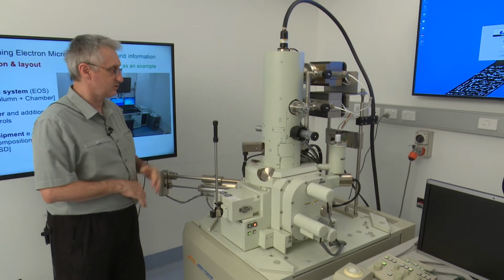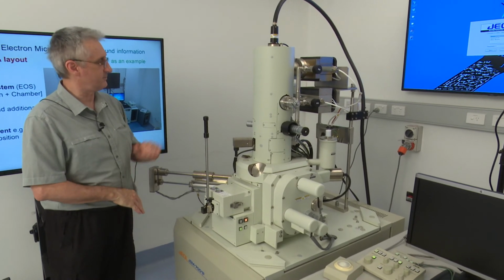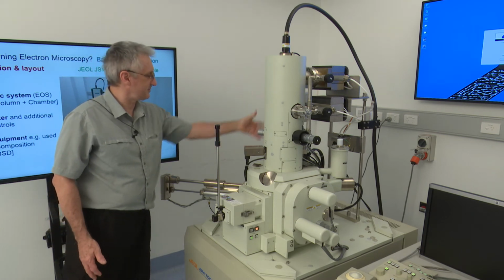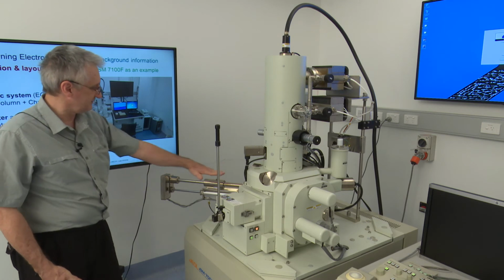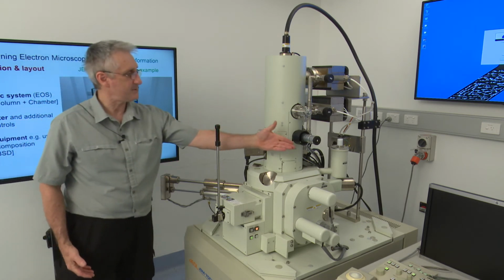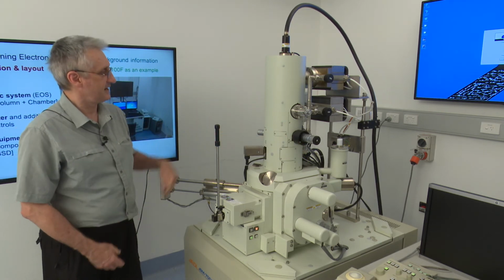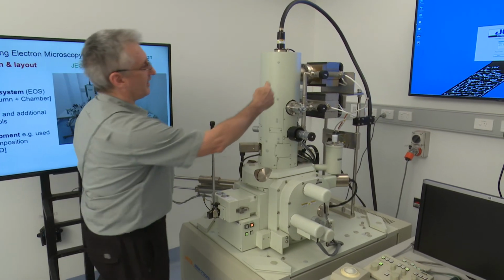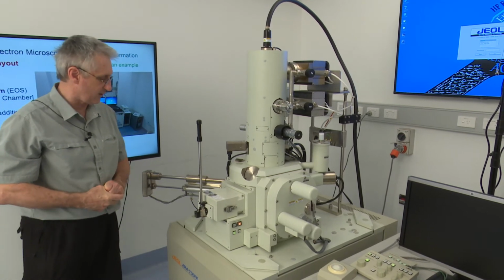So this is a high resolution SEM. We want to keep that quality of vacuum as high as we can in that chamber and certainly in the column. At the back here we have an energy dispersive spectroscopy set up there, and here we have a removable, retractable backscatter detector. We have an aperture adjustment here. This is a physical objective aperture as they call them, and a number of other controls on the SEM. You can see components of the vacuum system here, very important. We'll look at vacuum in some detail as we go along.